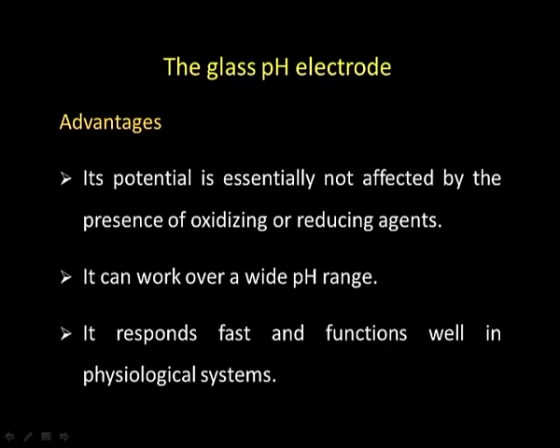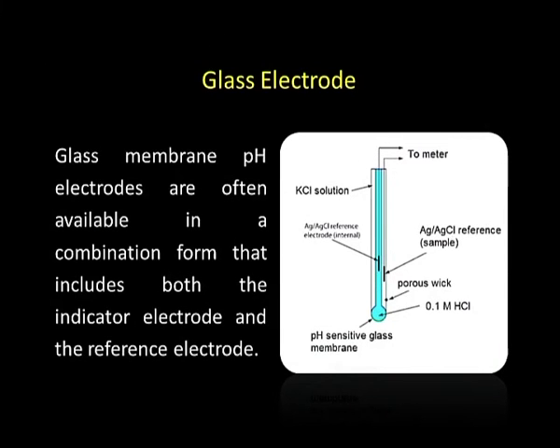Its potential is essentially not affected by the presence of oxidizing or reducing agents. It can work over a wide pH range. It responds fast and functions well in physiological systems. Let us consider a simple glass electrode.